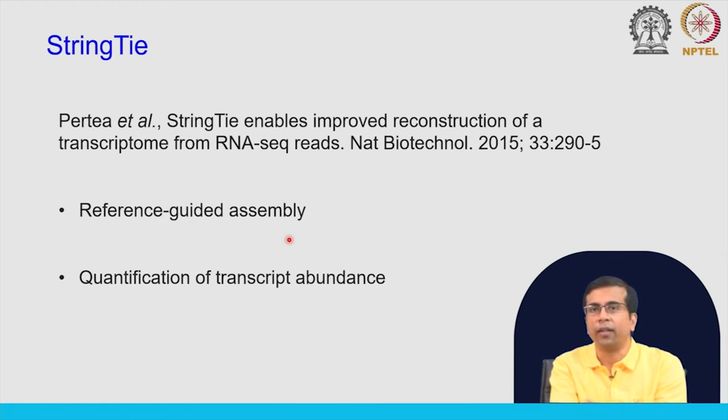So, what you will see, many of these tools that we discussed, they can do a lot of these different things, and there might be some overlaps. So, it is not strictly defined that this tool will do just quantification, this tool will do just assembly. There are also tools that can combine 2 tasks or 3 tasks together, as we will see as we go into this discussion.